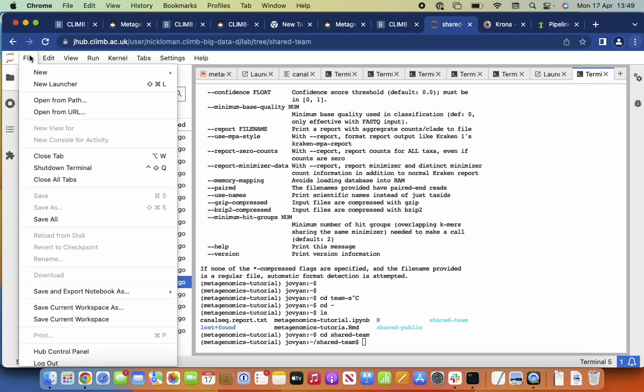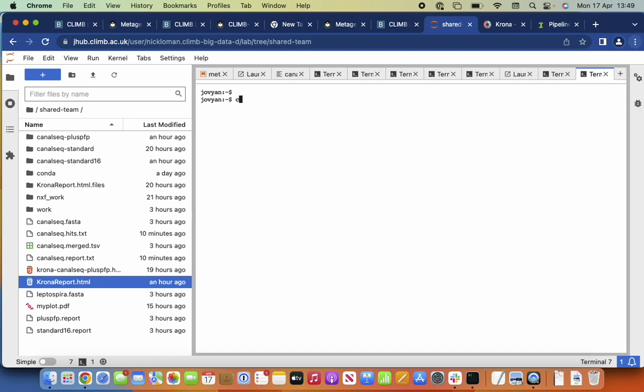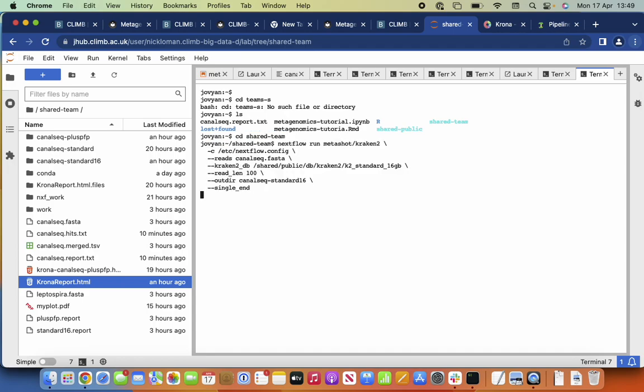Actually, I'm going to do it in a new terminal. Look, Raz, I'm going to show you that I've learned. I'm not going to activate that environment. Oops, although I can't remember the name of the directory. Okay, so I can just run that.